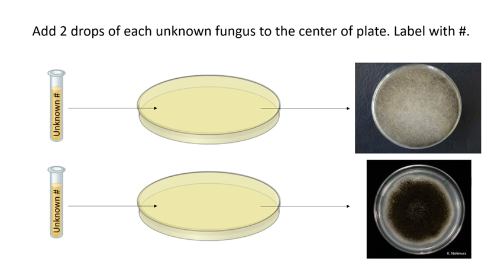There is a system in the results section to determine which 2 unknowns you should use, and it's based on the first letter of your last name. So for example, if the first letter of your last name is letter A, you'll be using a certain 2 unknowns, but if the first letter of your last name is the letter S, you'll be using a different 2 unknowns. So make sure you just pay attention to that when you are deciding which results you are tasked with interpreting.